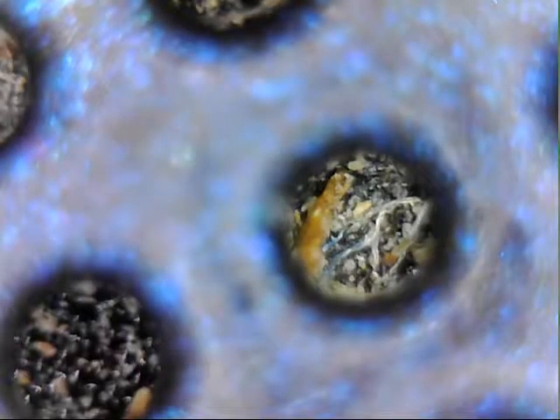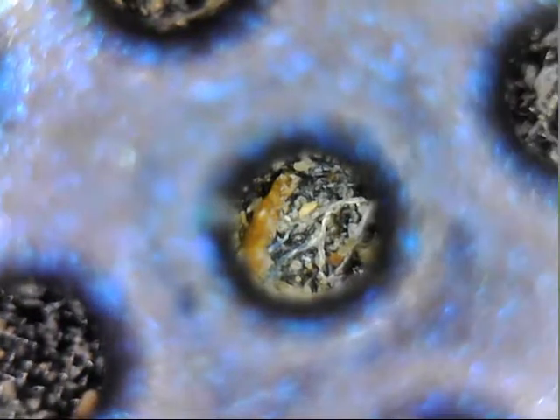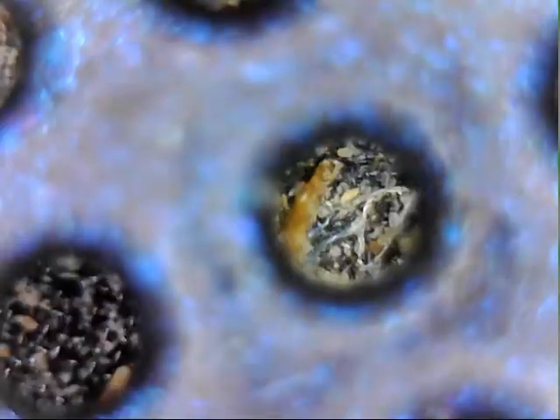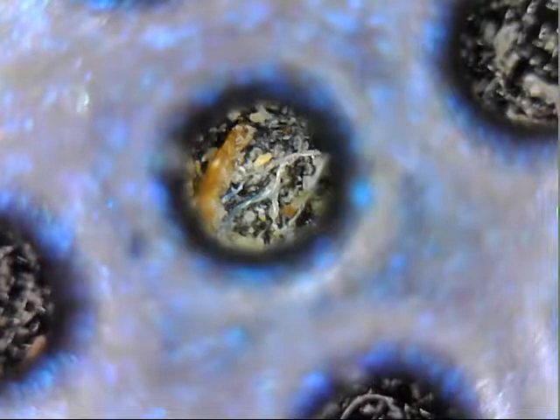Isn't that just awful? That's the speaker. Just look at that for a second - doesn't that just look awful? I think it's like dead skin cells and stuff. Just look at that. Luckily none of it's moving, because then I would just throw my phone across the room and never use it again. I'm not a fan of moving things especially under a microscope. Right there that one specifically - I don't know why the others aren't so much but that one is, just take a look at that.